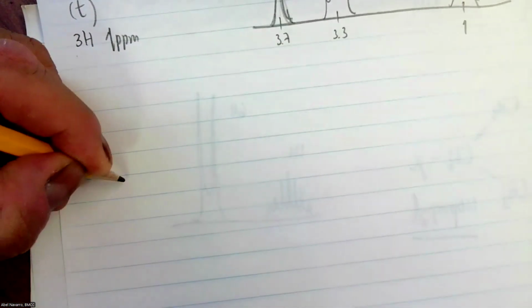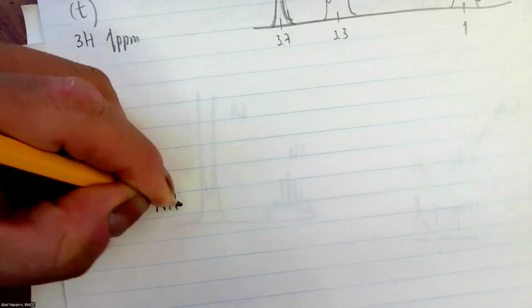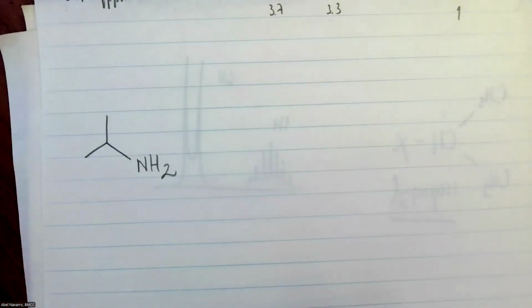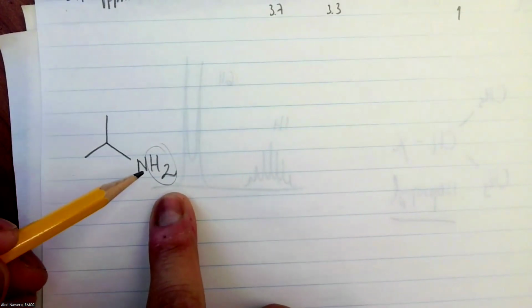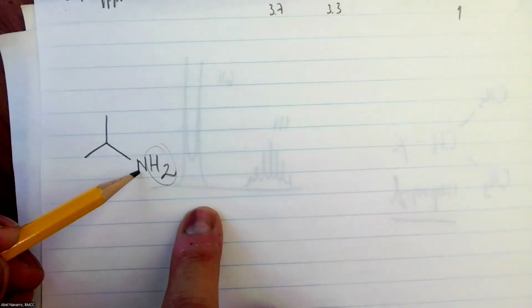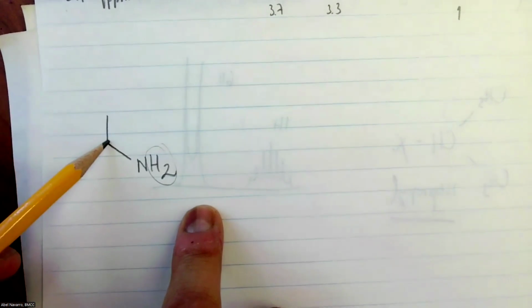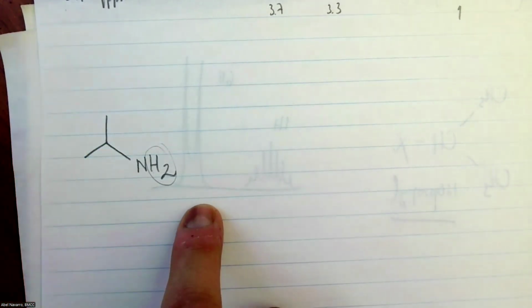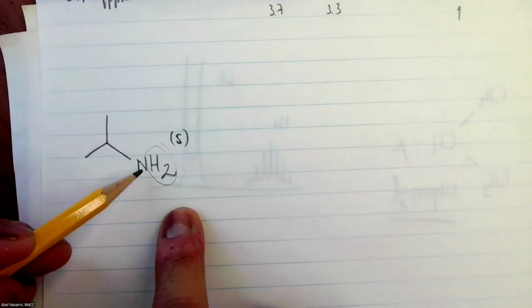That's really why you have to sketch it. Another one, let's see. Why not? Sketch this molecule. Same procedure. This one is an NH2. Something I didn't mention before is that there is no splitting if you have to pass through a nitrogen or an oxygen. The splitting only occurs if you pass through carbons. From this hydrogen to this hydrogen there is a nitrogen in between, so this one is going to be an automatic singlet because there is no neighbor. The splitting doesn't go through nitrogen.